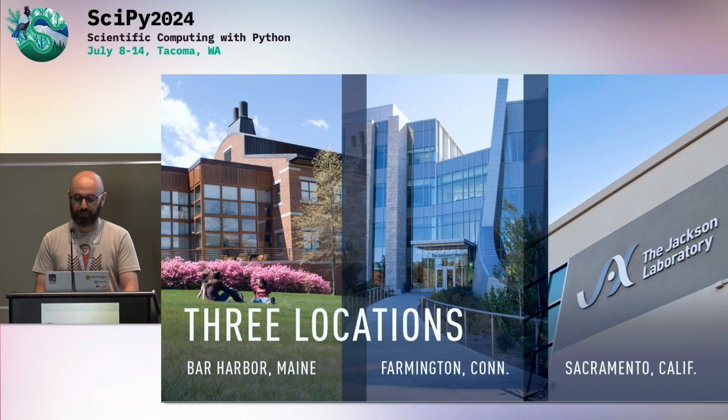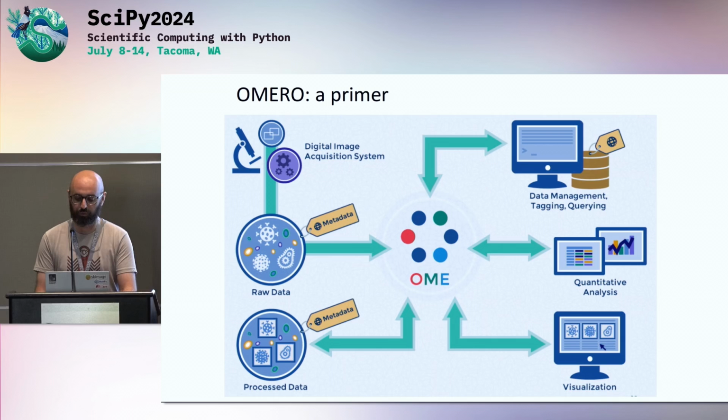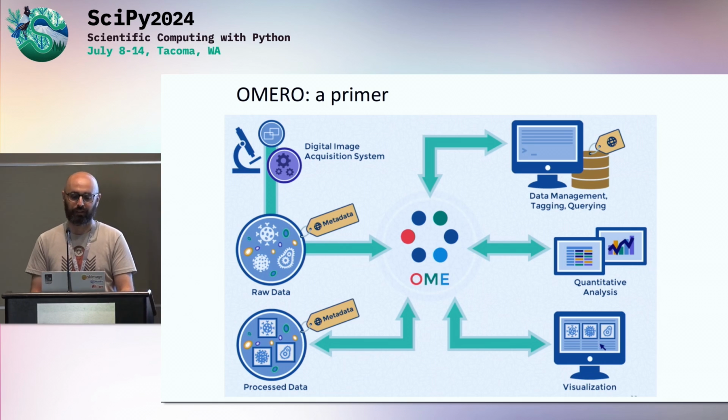Let me tell you a little bit about the OME ecosystem. So I'm just going to give you a quick primer on OME and Omero, which are 2 connected but separate things. OME is the Open Microscopy Environment. It's a consortium of academic institutions, universities, companies, and it's a consortium that came together to define a common data model for microscopy data.